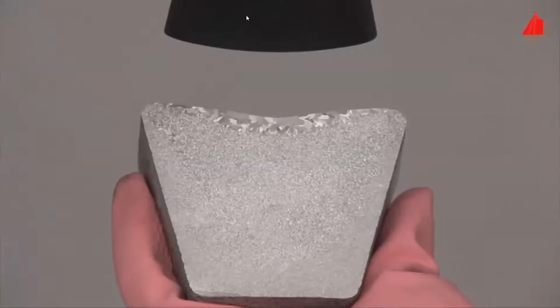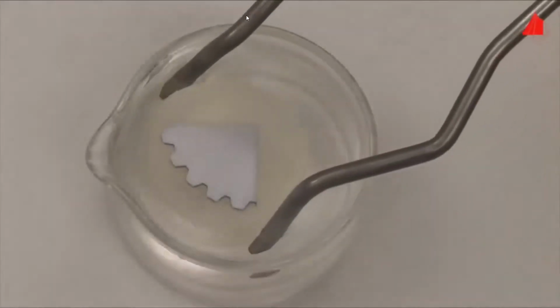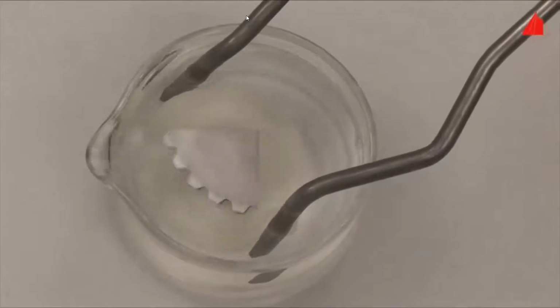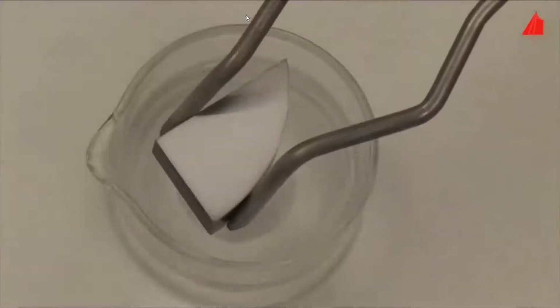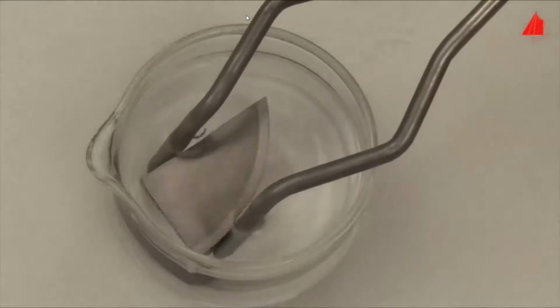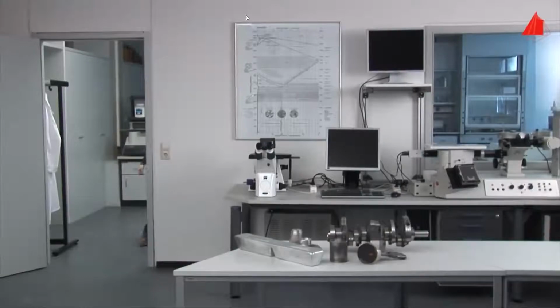Metallography gives an answer. In this video, we would like to introduce the macroscopic techniques of metallography. Macroscopic means to investigate a workpiece over a comparatively large area. Doing this, only little or no magnification is required. Often the naked eye is sufficient to examine the material. As a first sample, we are going to investigate an ingot made from an aluminium alloy.